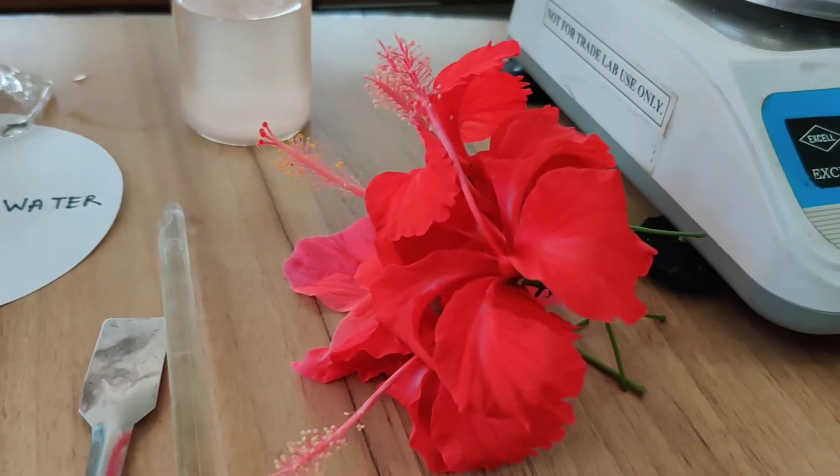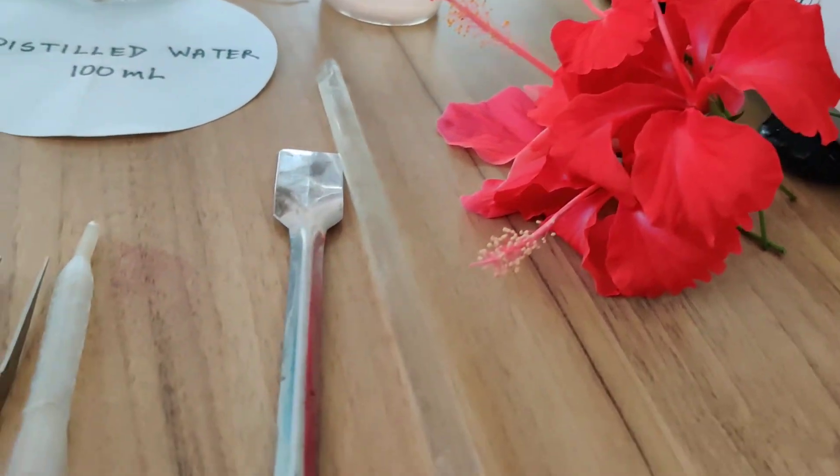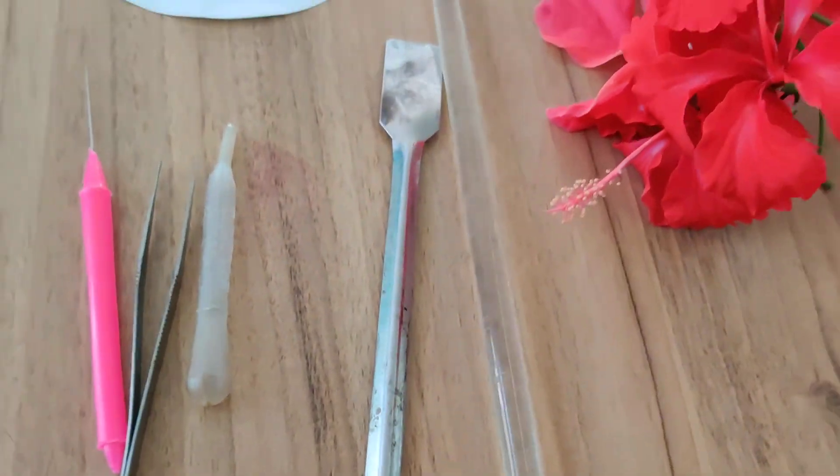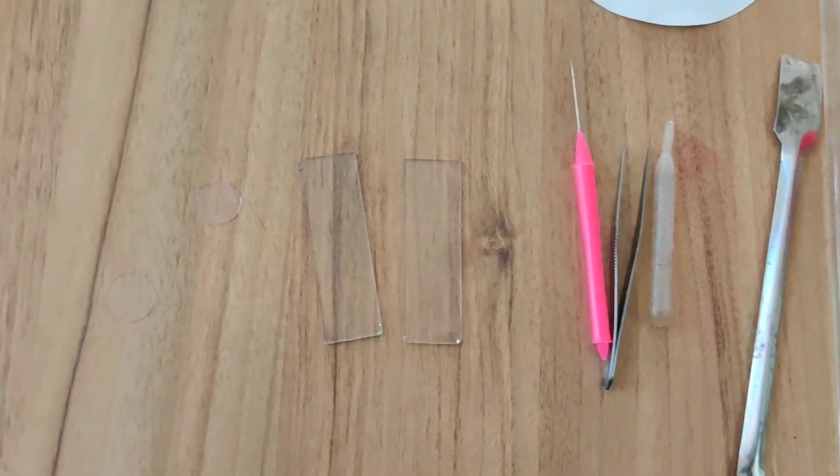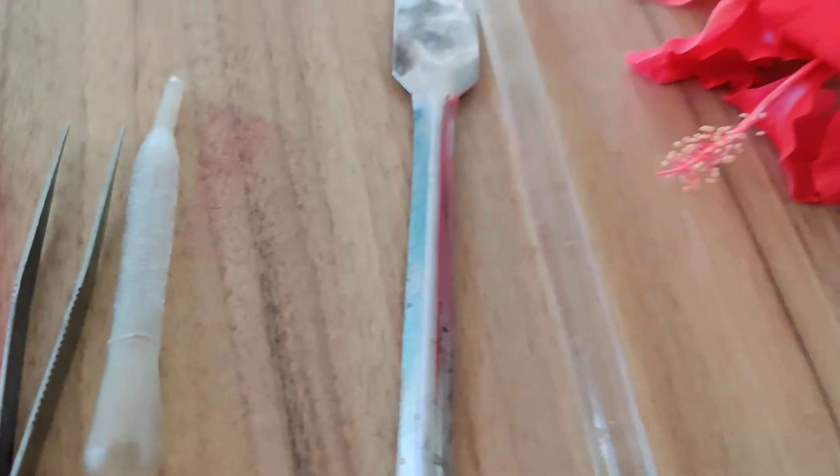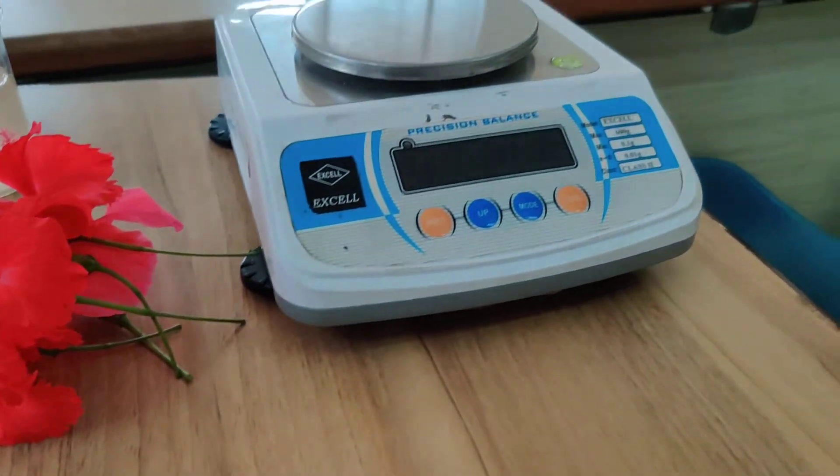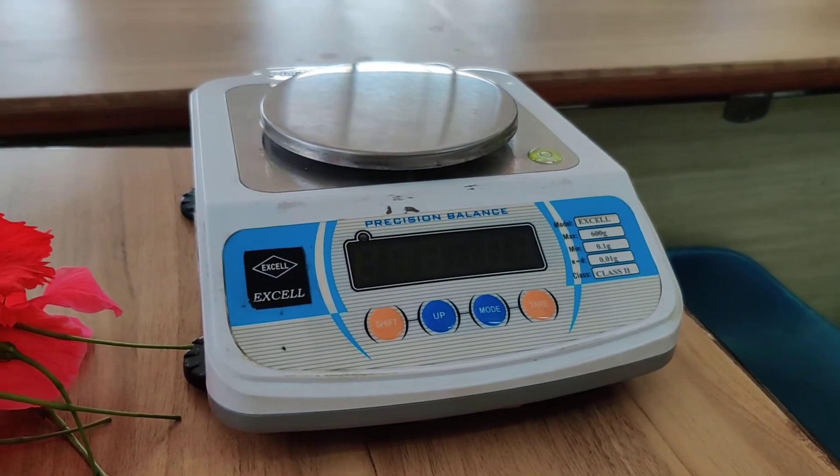We also need flowers, glass rod, spatula, dropper, forceps, needle, slides, and to weigh the chemicals we need a balance also.